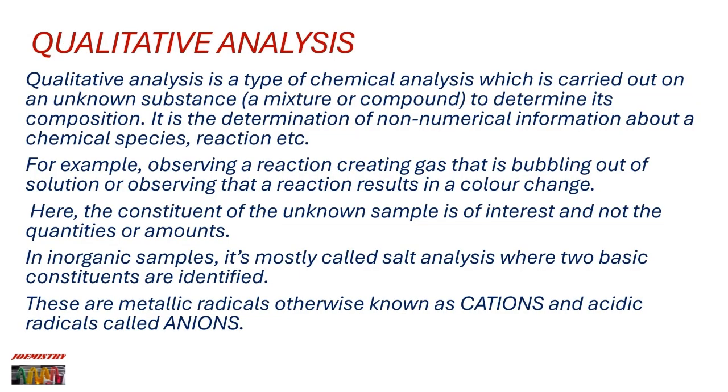Qualitative analysis. Qualitative analysis is a type of chemical analysis which is carried out on an unknown substance, a mixture or compound, to determine its composition. It is the determination of non-numerical information about a chemical species, reaction, etc. For example, observing a reaction creating gas that is bubbling out of solution or observing that a reaction results in a color change. Here, the constituent of the unknown sample is of interest and not the quantities or amounts.